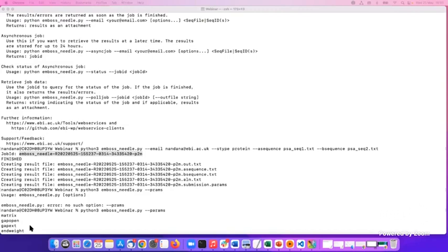What MSA tool would be the best if I want to align sequences that have one common functional protein domain, but they vary drastically in other regions, length and structure? That I may need to check.